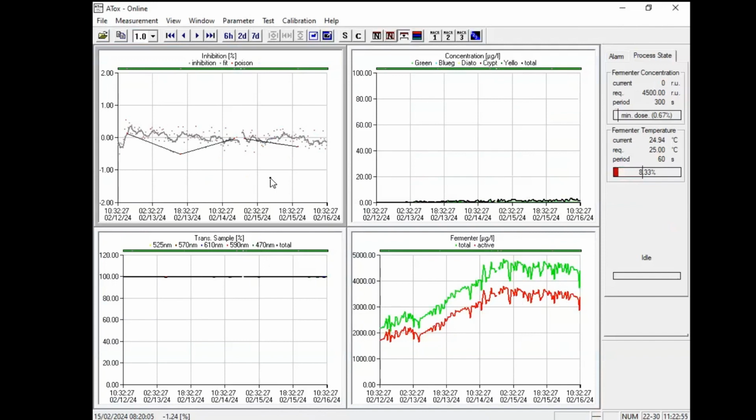Tap water is not always suitable. Tap water may be chlorinated, and if it's heavily chlorinated, it may be toxic itself because the chlorination also kills algae. Yeah, of course.